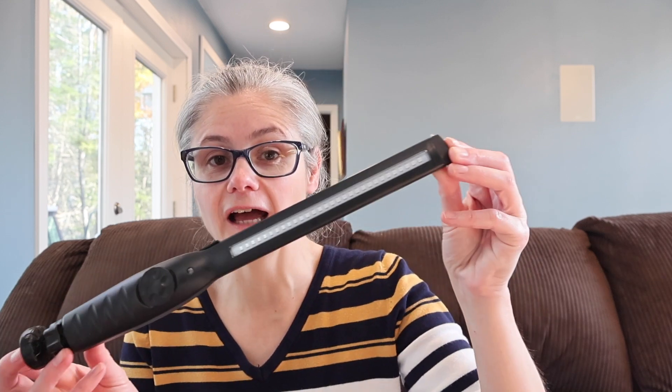Another thing to think about — if you have to hold it for a certain amount of time, say I'm trying to clean my whole arm, it's 10 seconds per width of the light, over and over across the whole surface. You see how repetitive and boring that is? I really don't see how that is more effective than taking a Lysol wipe and wiping, or Mrs. Meyers soap and spraying and wiping, or Sal Suds, or a Purell spray. I'm just not seeing this as a product I'm likely to use. But if you do rely on UV lights, you can know that it removed some bacteria from the kitchen sink and bathroom sink, was not able to remove any from the toilet rim, and did nothing for petri dishes with a large amount of bacteria on them.